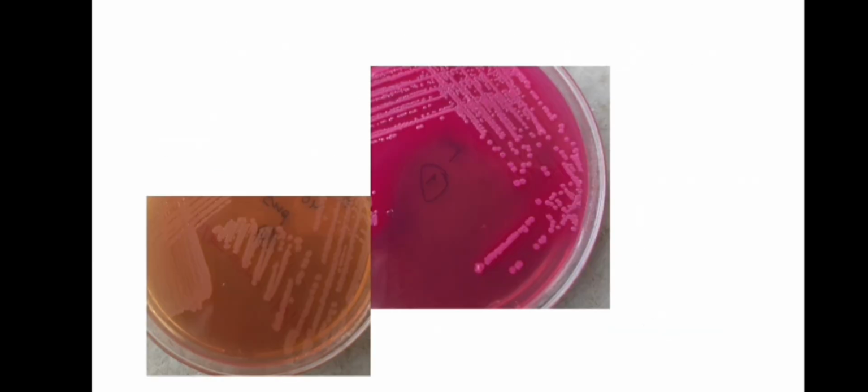So here you can see the beautiful pink colonies, and here with the same agar you will see colorless, right? So this will be E. coli and this will be some salmonella, but here we cannot be specific, just approximate.